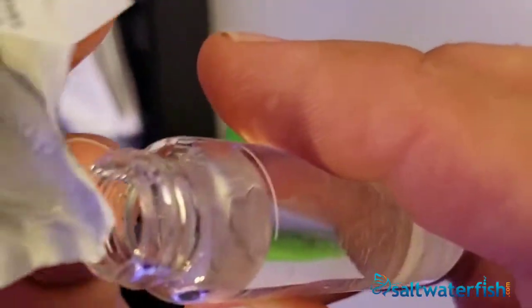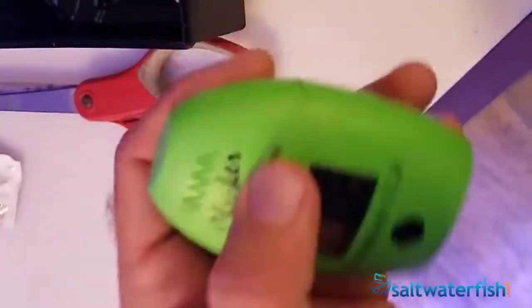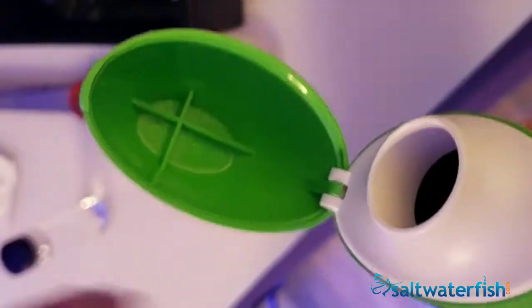The kit includes the phosphate ULR reagent starter kit, batteries, instructions, and a quick start guide. The Ultra Low Range Phosphate Checker can test a range between 0.00 and 0.90 parts per million.